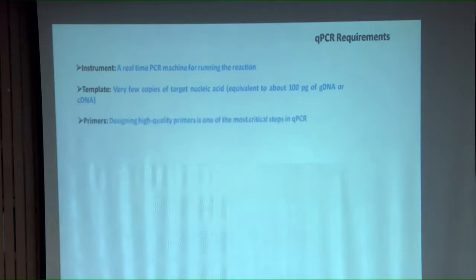Of course, primers. Primers are so important here, and you need to have the knowledge on primer designing and also the activity associated with primer designing and validation. I think there may be a separate class Dr. Subramaniam has already made, so somebody will deliver a class on that. Primer designing is the most critical step that decides the outcome of your experiments.